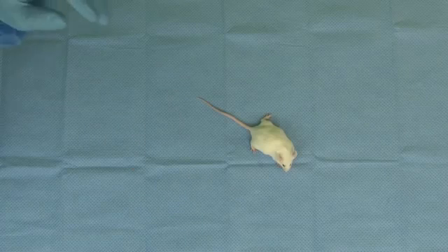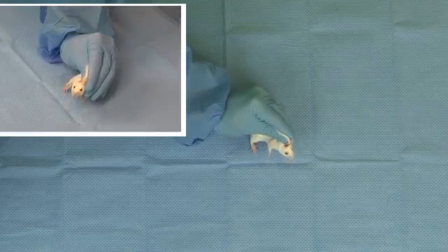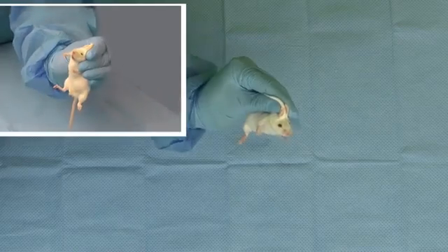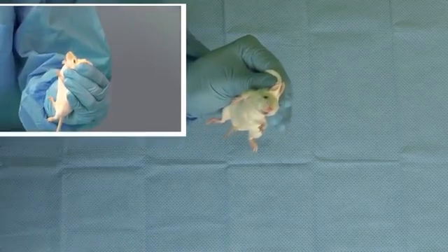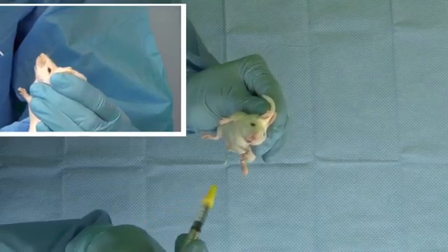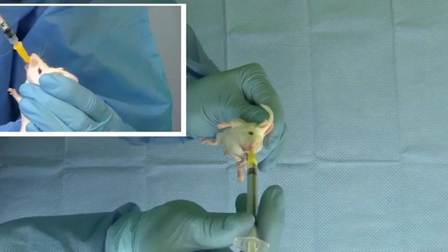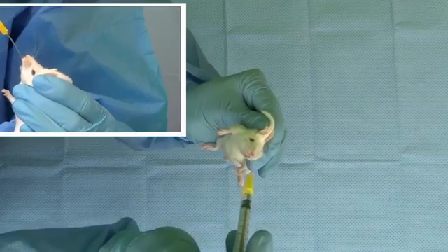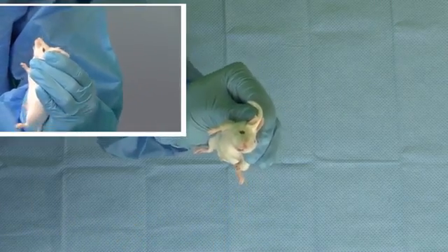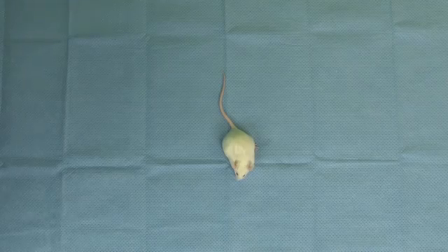Now let's look at the actual dosing procedure. The feeding tube should be inserted into the mouth to the right or left of midline. Entering from the side will reduce the chance that the mouse will bite the tube. Little to no resistance should be encountered, as resistance can be an indicator that the tube has entered the trachea. Administration should stop immediately if fluid is noted bubbling from the nose, as this is an indicator of aspiration.